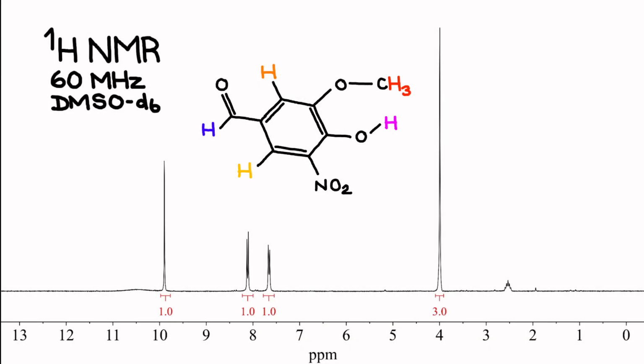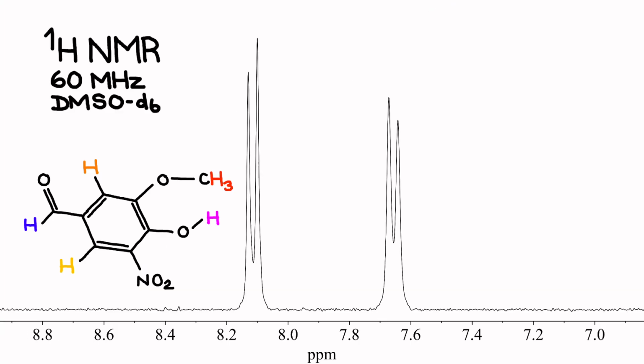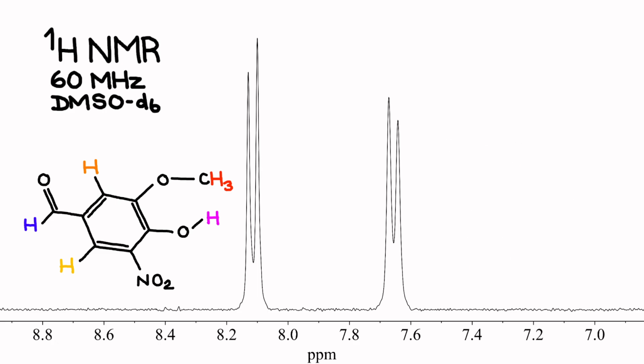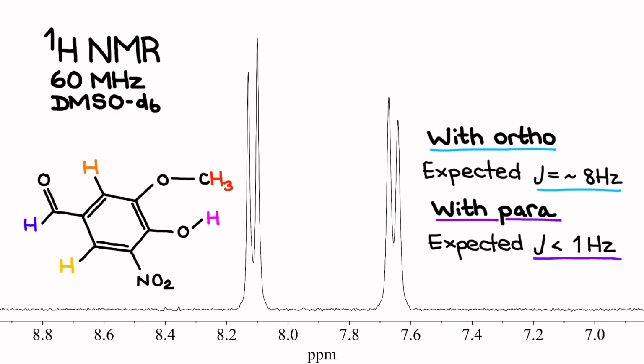In the proton NMR spectrum of 5-nitrovanillin, we observe the methyl, aromatic, aldehyde, and hydroxyl signals. Zooming into the aromatic region shows the two doublets with a characteristic meta-coupling constant around 1.8 Hz. One doublet corresponds to H2, and the other to H6 on the benzene ring. If nitration occurred elsewhere, we would see a different pattern, like a singlet or an ortho-coupled doublet.